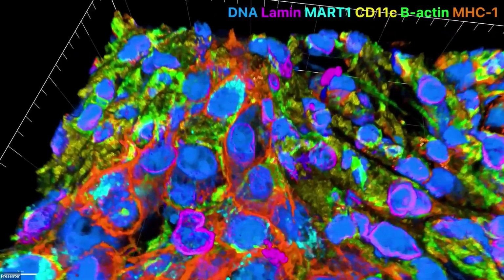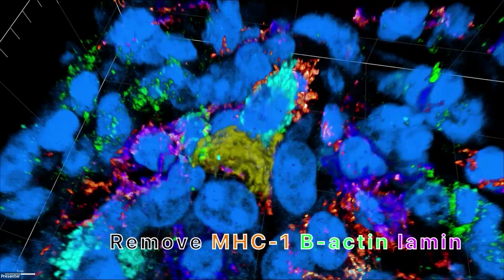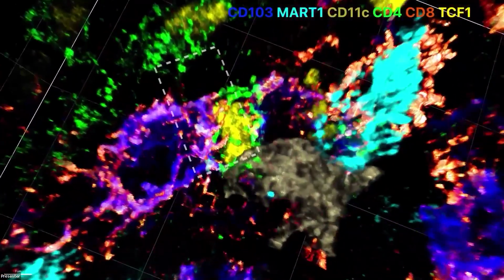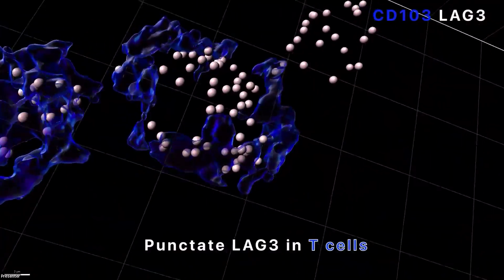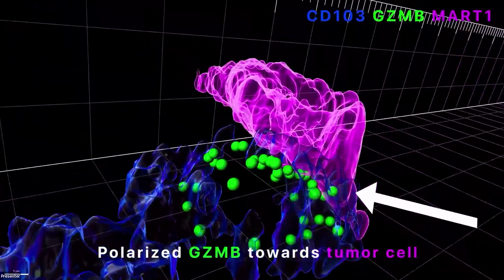How about this one? Again, in metastatic melanoma. We see here that if we pull back a few layers of cells, it reveals a few effector T cells interacting with each other, again with those long projections. We see that one of the T cells is engaging with the tumor cell because it is directing its granzyme B payload in green towards it.